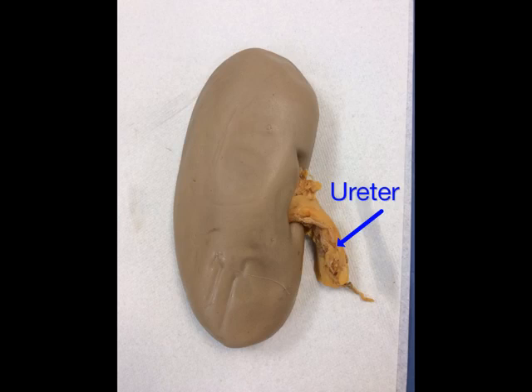And finally, the last structure located at the hilum is the ureter. The ureter transports urine from the kidney to the urinary bladder.